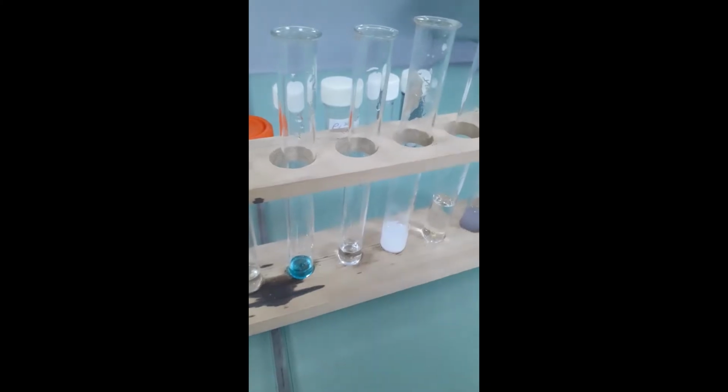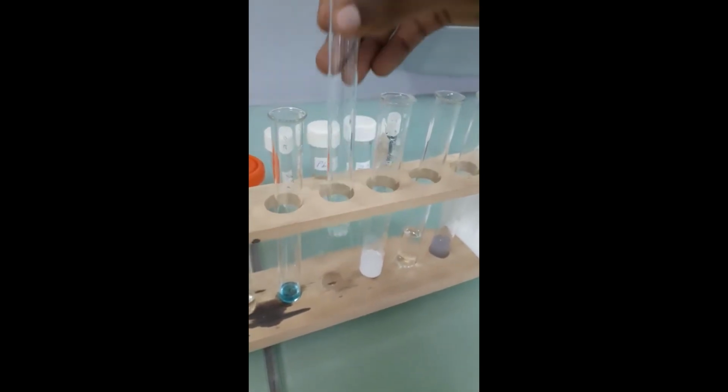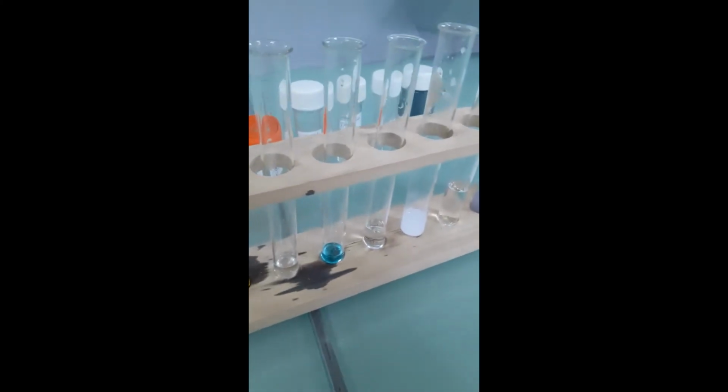In the next test tube, there is Ca2+, and I'll be adding a few drops of dilute ammonia. That's more dilute ammonia added.